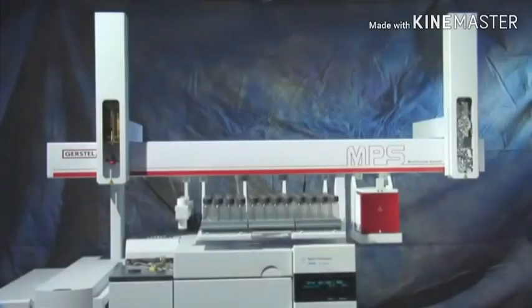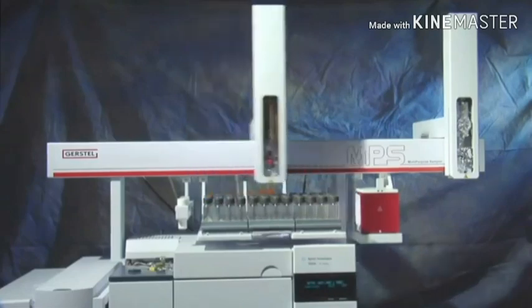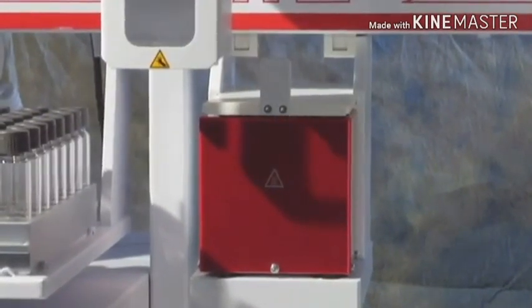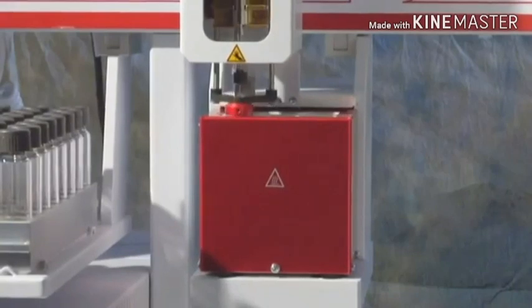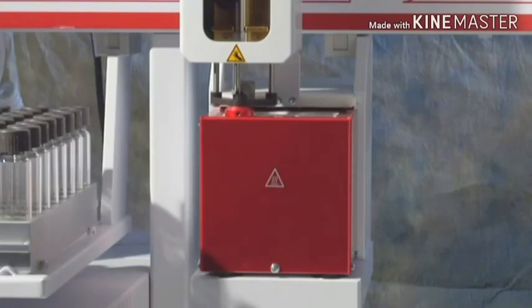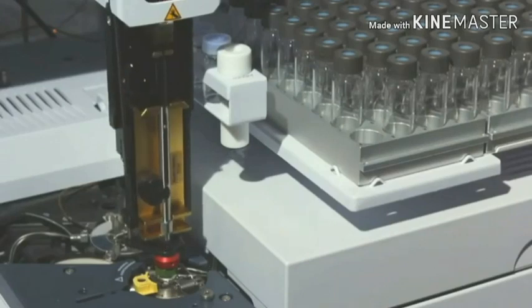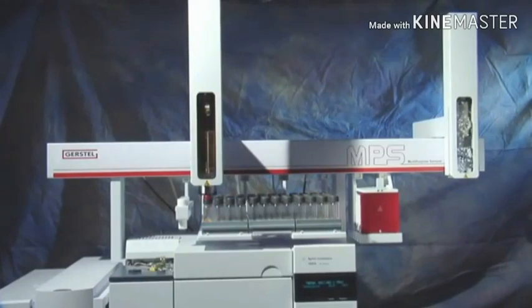The Gerstel Multipurpose Sampler completely automates solid phase microextraction, commonly called SPME. When performing the SPME technique using a standard split-splitless inlet, the Gerstel Multipurpose Sampler transports the sample vial to the heated agitator. Once there, the sample is incubated to establish thermodynamic equilibrium between the headspace above the sample and the sample itself. The SPME fiber assembly is then inserted into the headspace of the vial and the fiber is exposed. Volatile analytes are then concentrated onto the coating of the SPME fiber. The fiber is moved to and inserted into the inlet where the fiber is exposed, and the analytes are desorbed from the fiber into the inlet and onto the GC column. After analysis, the sample is returned to the tray and the MPS starts the next sample.